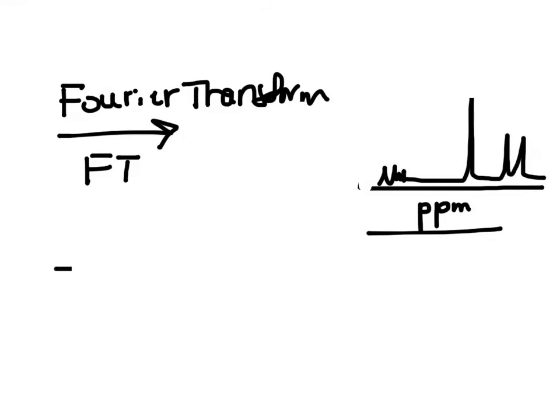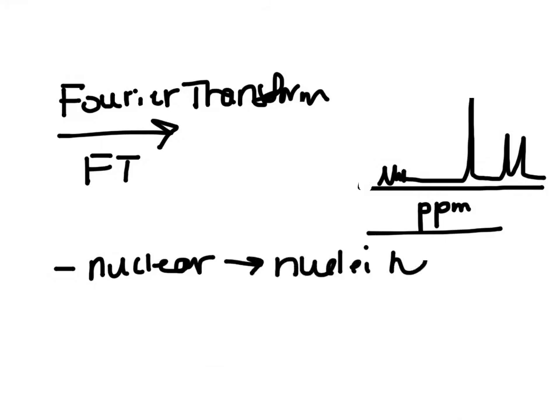So if you recall, we have the nuclear component, right? That's where we're looking at nuclei that have spin. We apply the magnetic field.